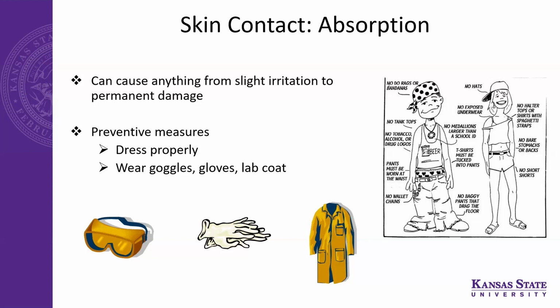Any more questions? So if they're not dressed appropriately, depending on the labs, I will... But again, we have to respect the students too, because they pay tuition. I don't want them to go home. For example, last week, because we were not using any chemicals, depending on the lab, I excused them. But we have our lab safety agreement, and it clearly says that if you are not properly dressed, you can be sent home, and it is up to you to come back.